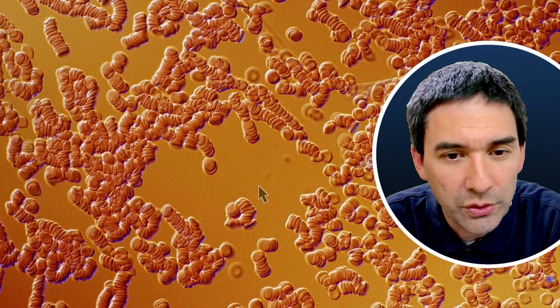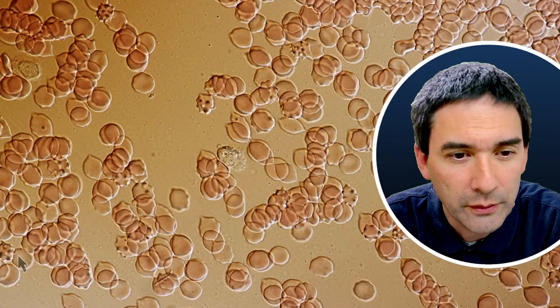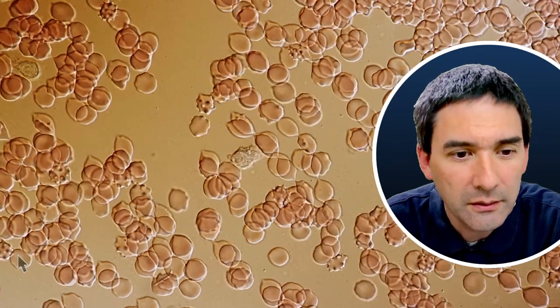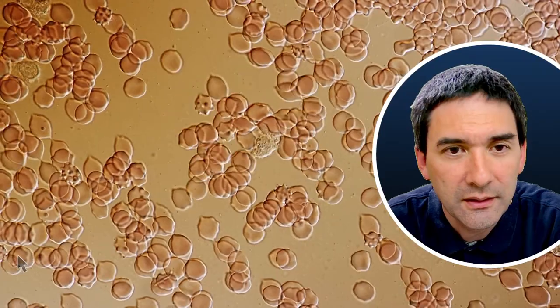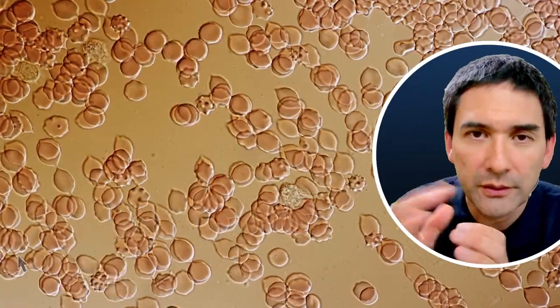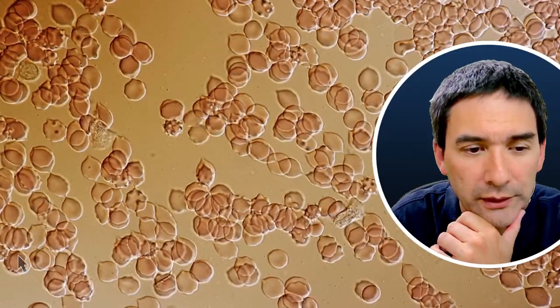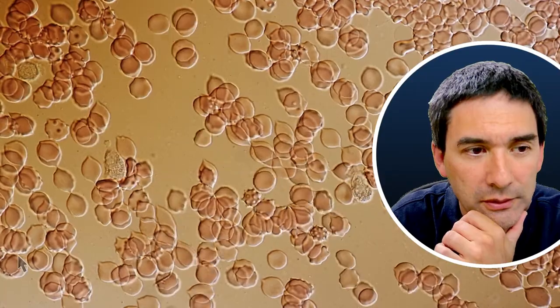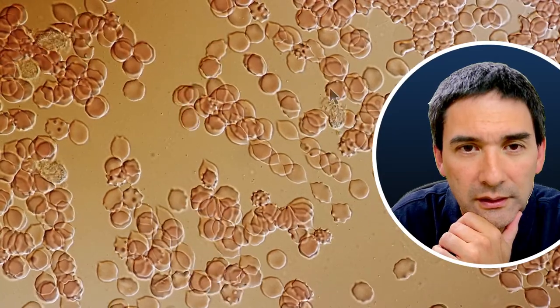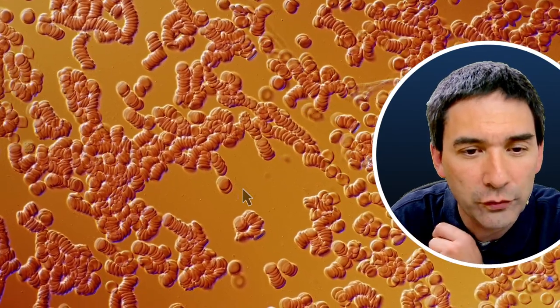And I just want to show you, when we go back here now, this is a time lapse. Let me move the arrow out of the way. So this here is a time lapse, okay? And what you are able to see here is that the blood cells don't stack up because I used much less blood, and therefore they're pressed flat. But you're also able to see a white blood cell moving around. The white blood cell is this guy over here, okay? And you're also able to see that some of the cells start to look a little bit of this strange wrinkly shape.